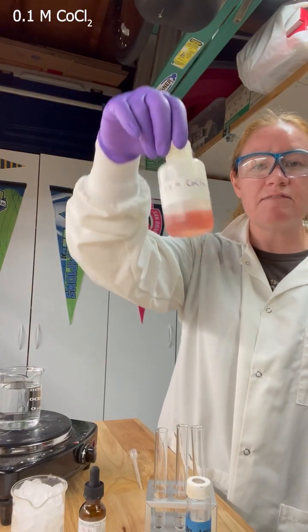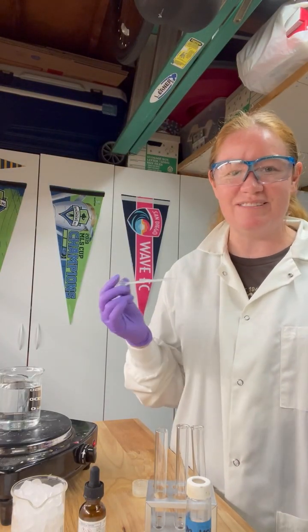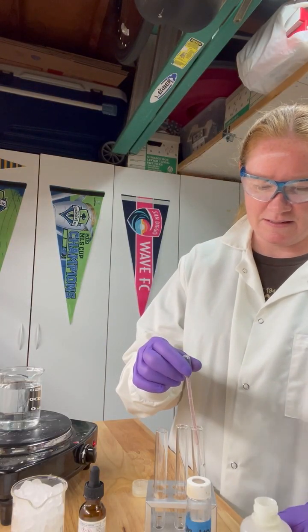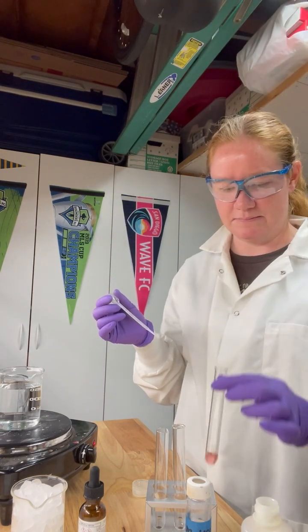All right, so we're going to start off our reaction with a 0.1 molar cobalt 2 chloride. You can see from the bottle that we're already at a pink color. So our hexaaquacobalt 2 ion is simply established by dissolving the cobalt 2 chloride into water. Okay, so I'm going to put some of that here into my test tube. So you can see it's nice and pink.